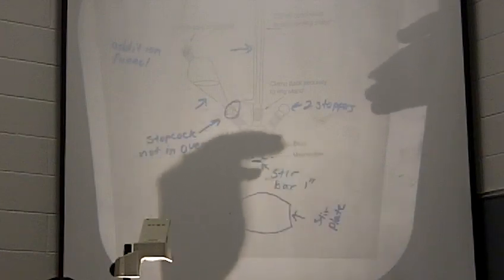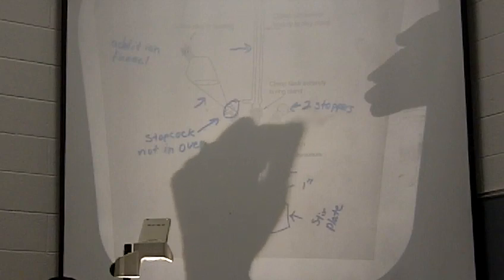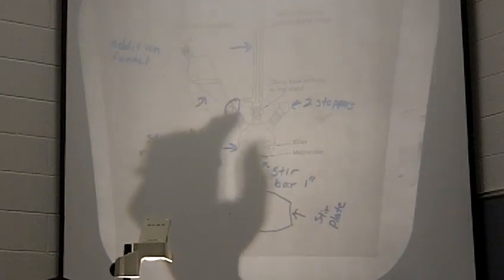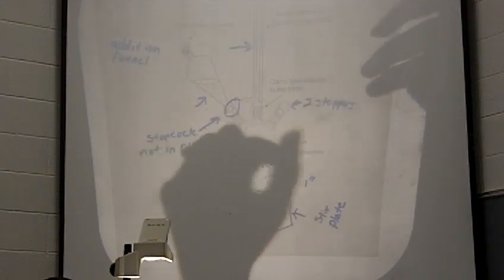At the start of this reaction, after you get all your glassware assembled, you're going to put your magnesium in here, okay? You don't want to weigh out your magnesium till you're ready to use it, because it actually can oxidize sitting in the air. So you don't want it just sitting in the open. Don't weigh it out till you're ready to stick it in your reaction.